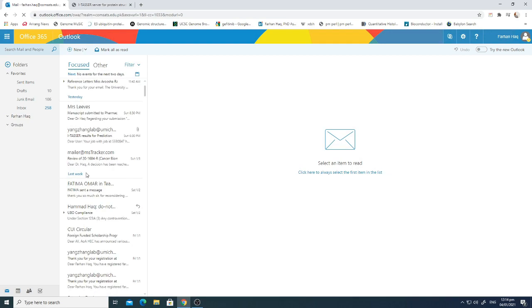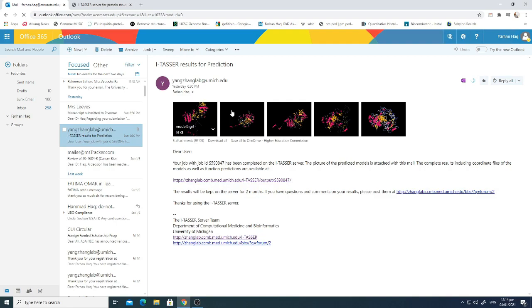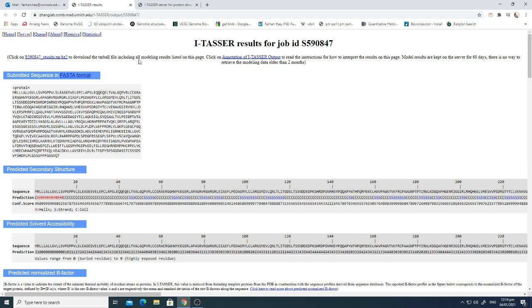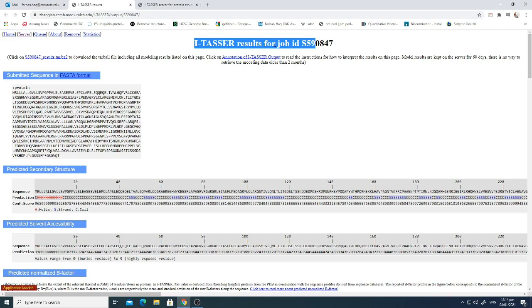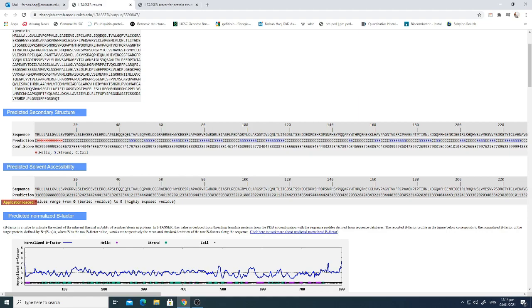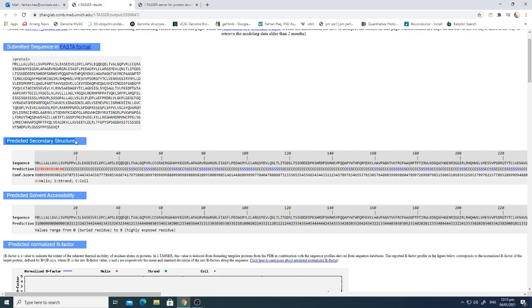Once the structure is predicted, it will be sent to your email. In the results email, they have shown all five possible structures of the given protein sequence. If you click the link mentioned in the email, you'll go directly to the graphical output of the I-TASSER results. The job ID is provided by the I-TASSER platform, and the submitted protein sequence is shown there as well.